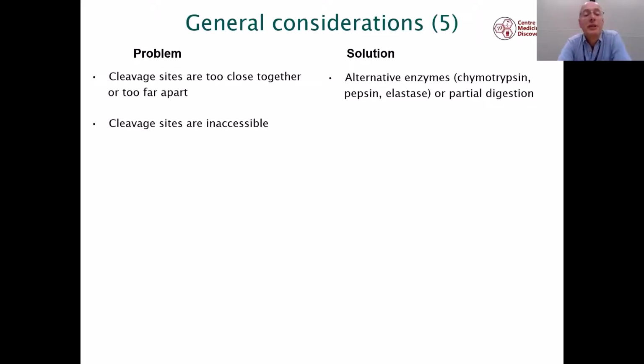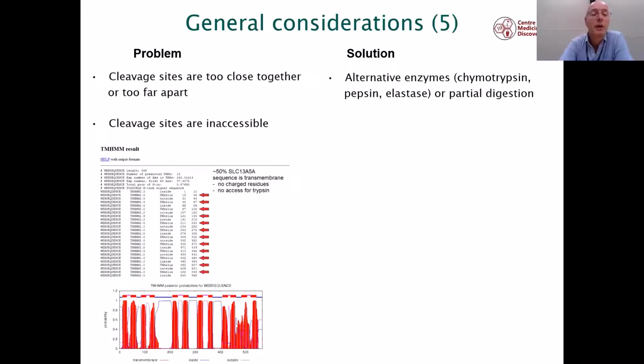Another problem is those cleavage sites may be inaccessible. And just to go back to our example of SLC13, it's a membrane protein. As I said, I have marked on here the membrane spanning regions of SLC13. In those regions, there are no charged residues. Trypsin requires lysine or arginine, which are positively charged. So there are no cleavage sites for trypsin.